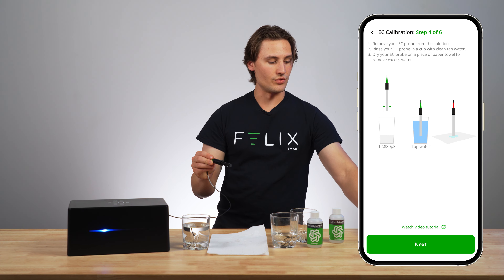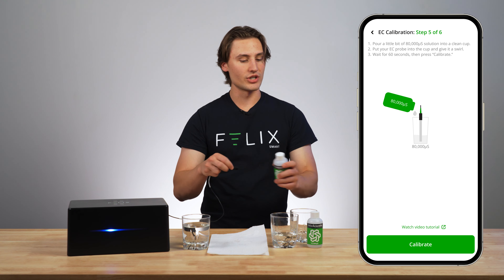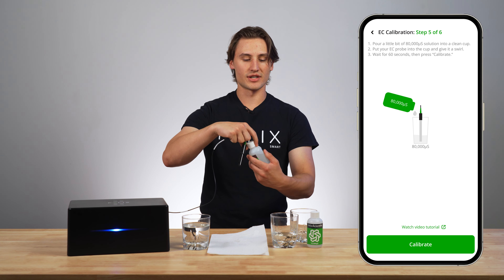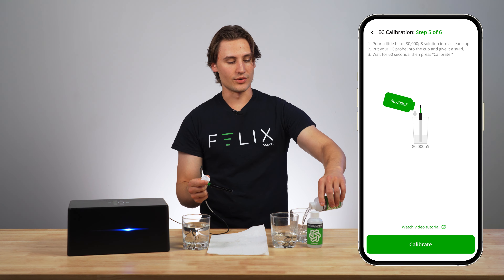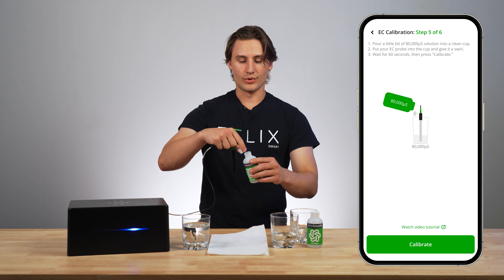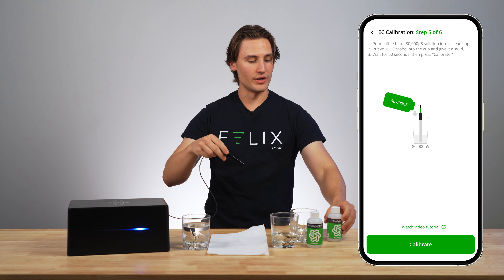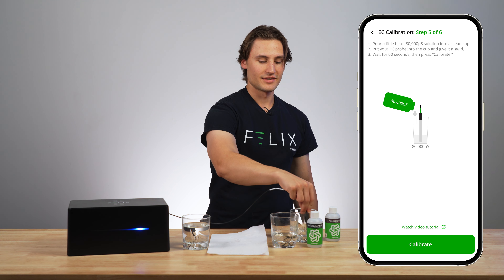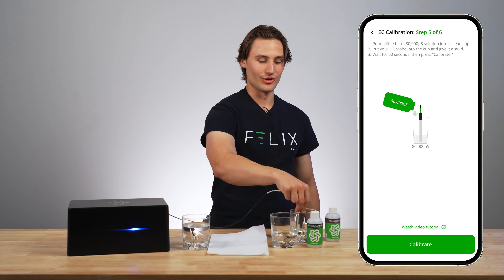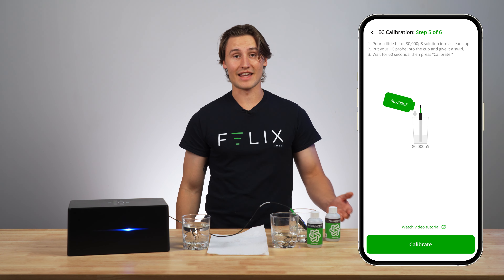Now I can go to the next step and it says pour a little bit of my 80,000 solution into a clean cup, just like before with my 12,880 solution. I'm going to do exactly the same thing — pour a little bit of that. Now I'll put my EC probe into this cup and swirl it around. I'm going to wait about 60 seconds on this step and then I will press calibrate.